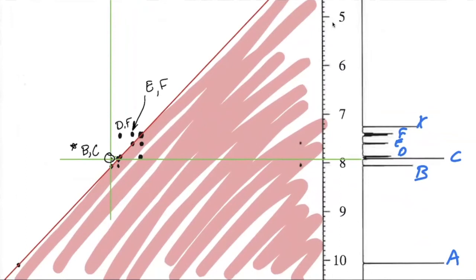So the vertical line at the top is coming down from B, and like I said, I think it's going over to C. But let's go ahead and pick this horizontal line up and move it over just out of the way so that we can look at the identity diagonal for a second. If you look here in that region, we have kind of a lot going on. We have what looks like two peaks on the identity diagonal and then two cross peaks that mirror one another.